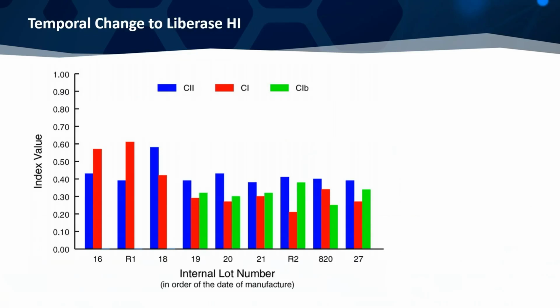First and foremost, in lot 18, the ratios are reversed. And secondly, you started seeing this back peak, this second peak, the C1b peak, we refer to it, in the fractions. And this was very variable.